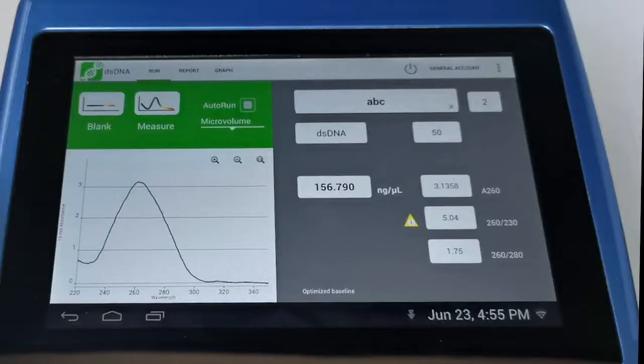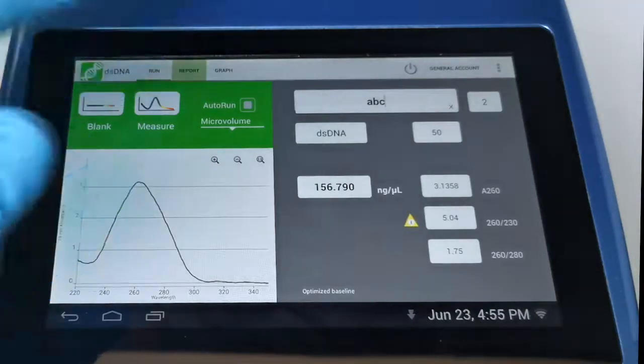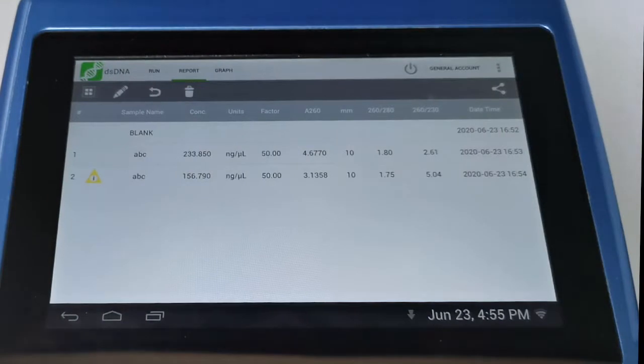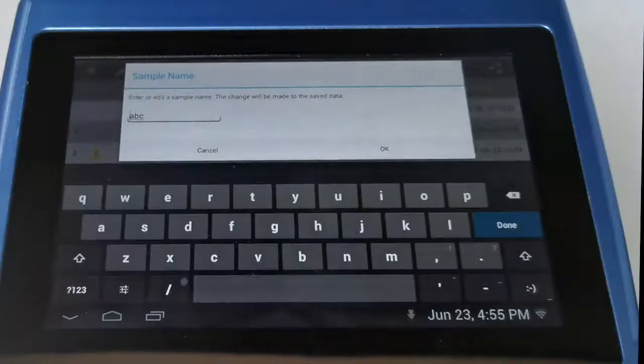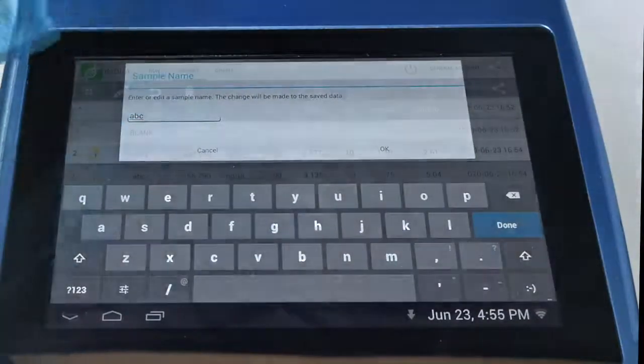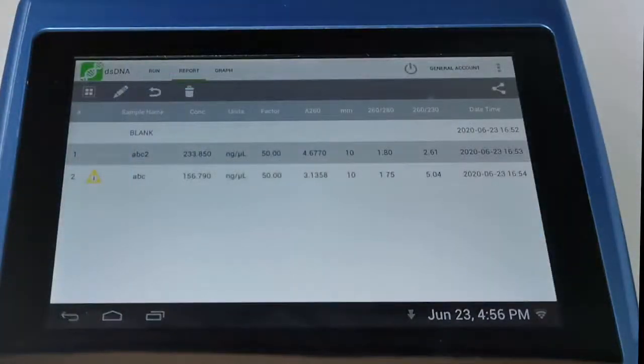So once we have a few samples in the system, and once we've run our samples, we can either swipe onto our report screen, or we have tabs along the top of the screen here. So we go to our report screen, and you can see the data that we've just captured is presented in a tabular format. And this includes our sample name, if we've chosen to put one in. If we want to put one in at this stage, we can edit the data from here. So in our table, we see the concentration, the units that we've measured in, and information on our purity ratios.